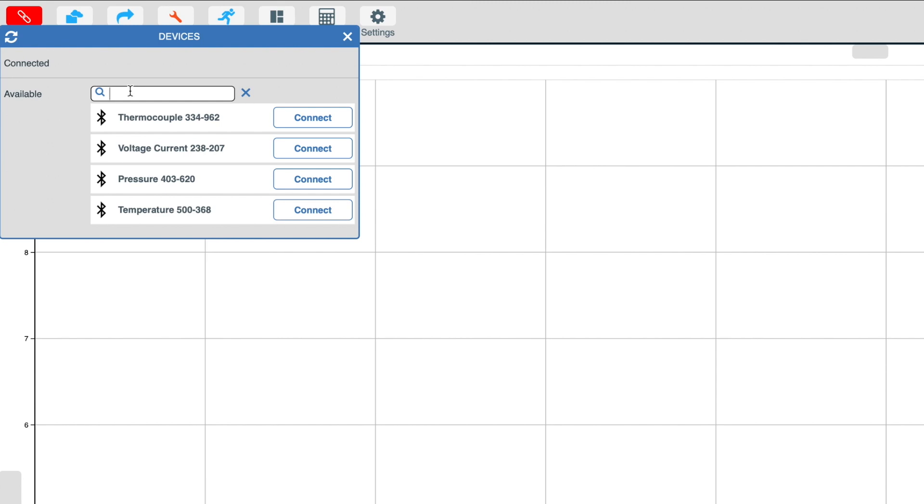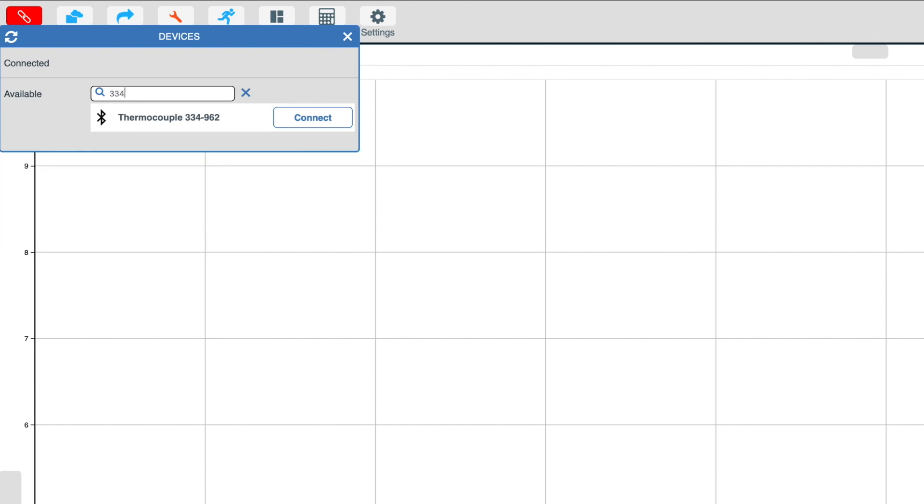If I wanted to filter the list by the unique ID number of the sensor that I may wish to connect to, I can simply type in the unique ID number into the EasySense 2 software to filter the list, such as 334, which is now only showing the thermocouple. To clear the filter, simply click on the cross.